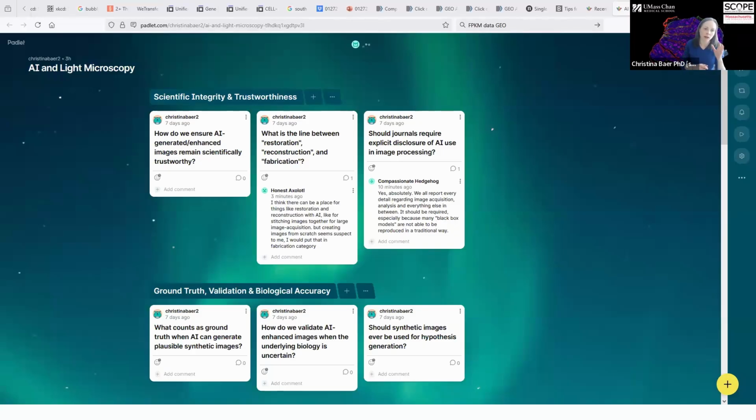And that's where having those records and having that complete traceability, I think, is going to be so important from that reference point. And I'm hoping that's something that I at least can communicate to my users: you do need your data to be auditable, particularly now. And that's one of the reasons we all, every day, I think I do this every day, discourage people from exporting as a TIFF file, right?